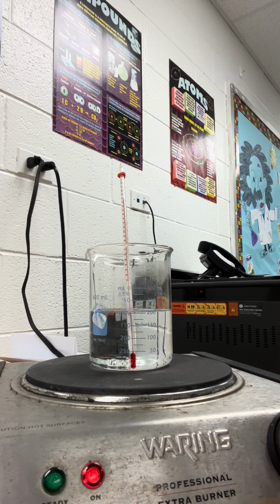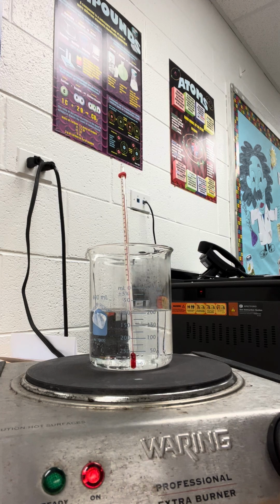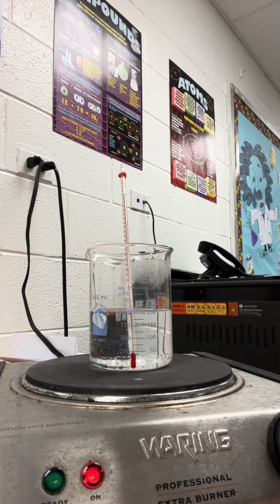So as you guys can see now in this video, we are almost to the boiling point. Right now we are at 85 degrees Celsius. So we are starting to see bubbles form around the base of the beaker because the molecules are now being heated up to a point in which they will be pulled apart and turned from a liquid to a gas, known as evaporation. So we are approaching the boiling point.